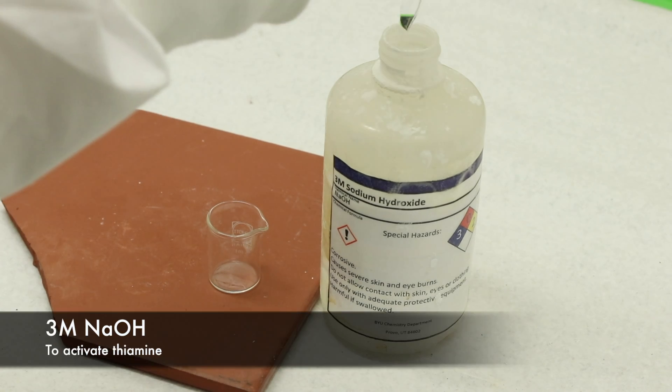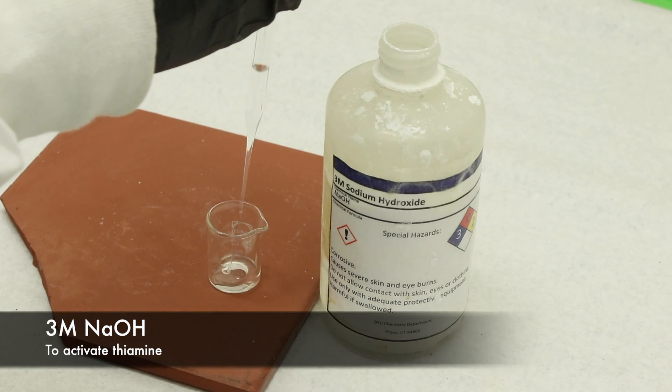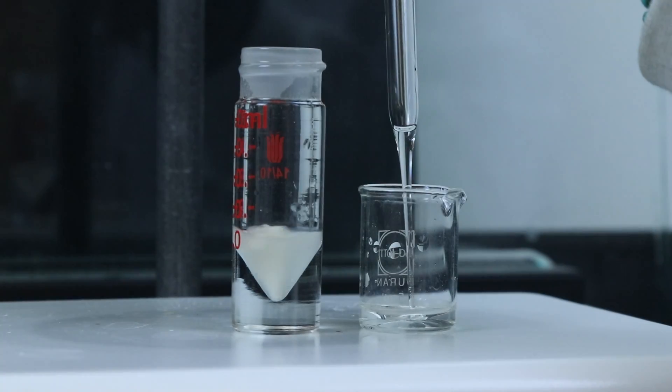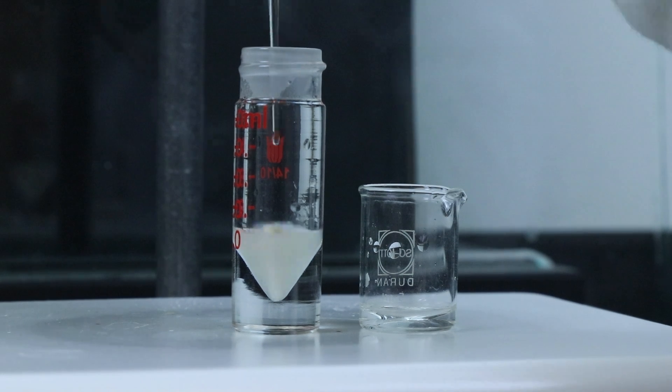Then I'll get some 3 molar sodium hydroxide which will be used to activate the thiamine and I'll be adding that dropwise just until the solution turns and remains a bright yellow color.